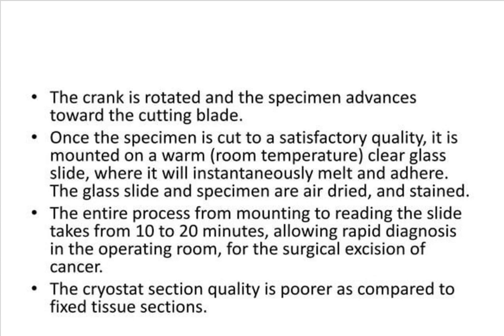Once the specimen is cut to a satisfactory quality, it is kept at room temperature, which is warm, and there is a clear glass slide and it adheres to it using the embedding media. The entire process from mounting to the slide takes 10 to 20 minutes. So it allows us rapid diagnosis in our operating room, for surgical excision also, and for knowing the margins of the cancer.